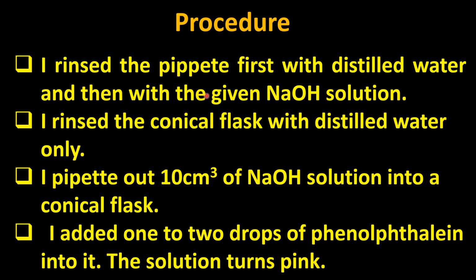Now this is the question for you. I am adding phenolphthalein in base. Can you please tell me what will be the color? Yes, the color will be pink, because here I am talking about the base. So that's why the color changes to pink.